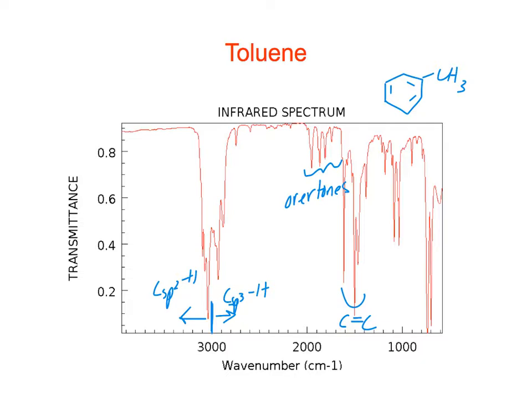But I read some things more recently that said that that's not really that reliable. But if we see these overtones, I think we can at least say that it's likely to be a benzene ring. And we used to look, and maybe there might be information like this in our text, down here, way down here, would tell us about substitution pattern as well.